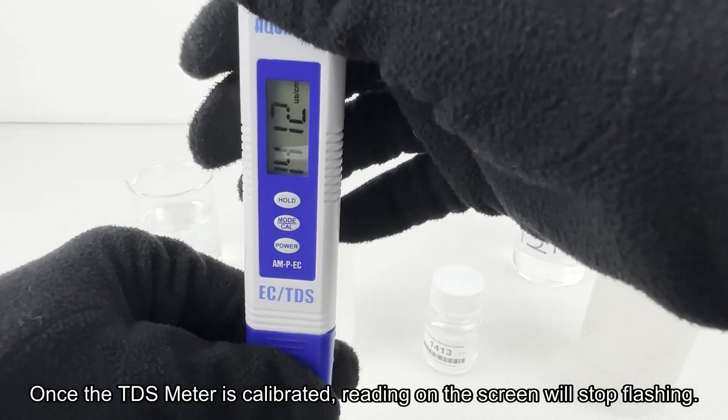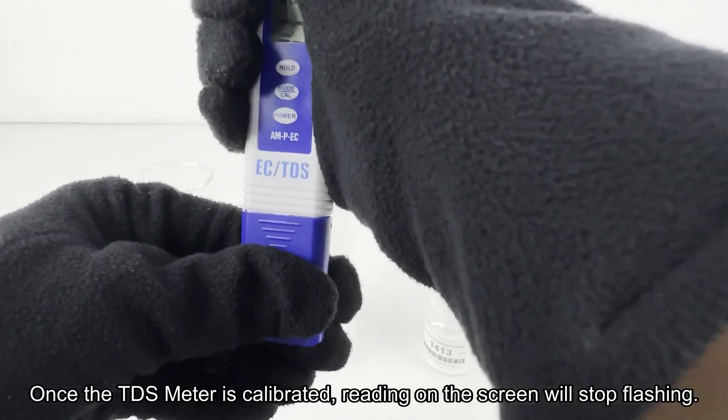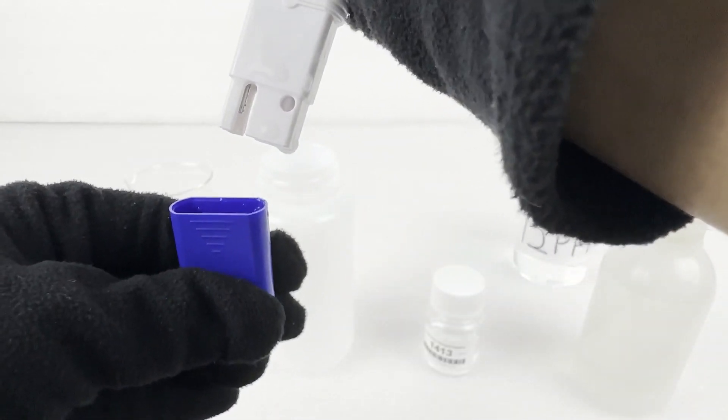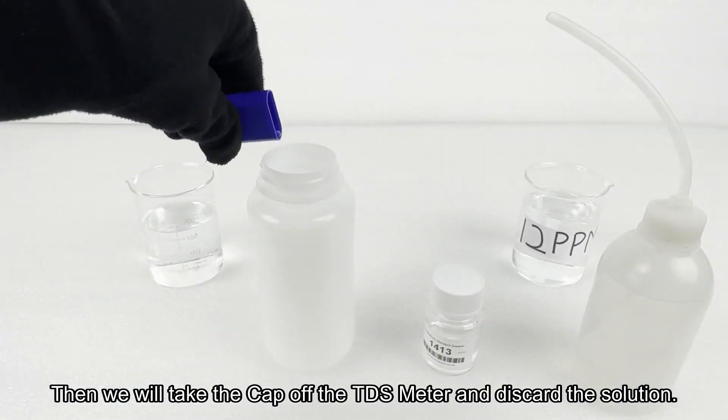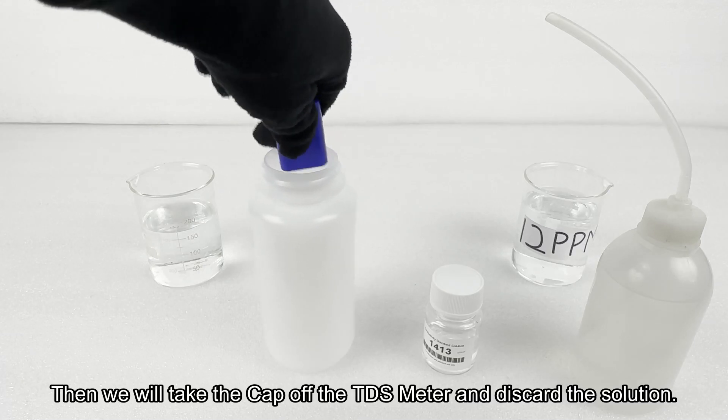Once the TDS meter is calibrated, the reading on the screen will stop flashing. Then we will take the cap off the TDS meter and discard the solution.